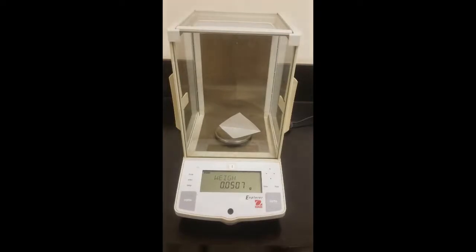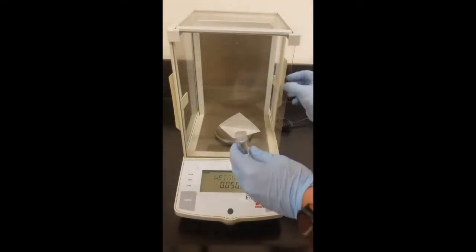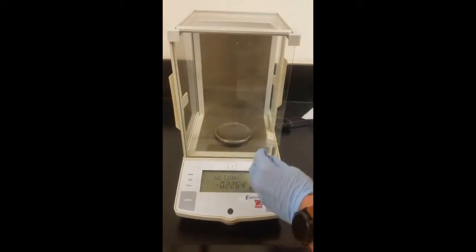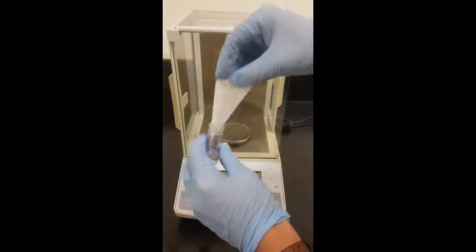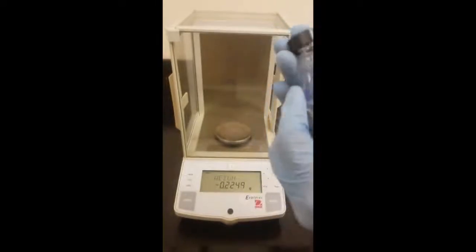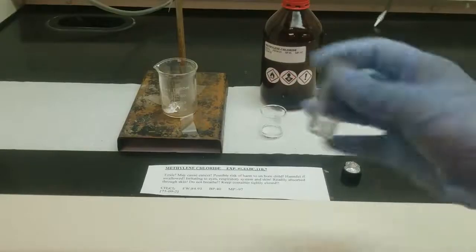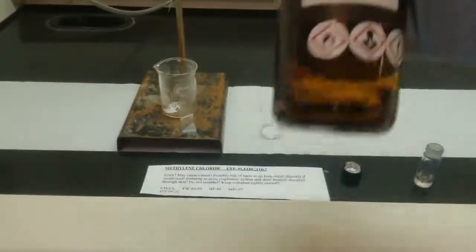All right, and then you can see our mass right there, and we'll just go ahead and pour it into our conical vial. And now it's in our vial. All right, so we've got a conical vial with the benzoic acid in it. Next up, we're going to add some DCM, some methylene chloride to the solution. We're going to add 600 microliters.